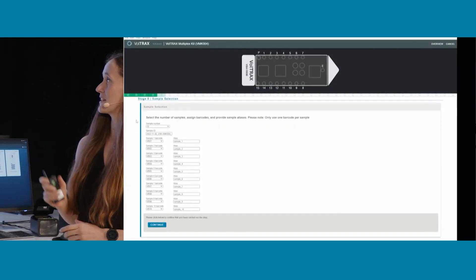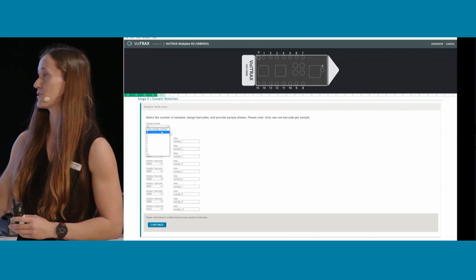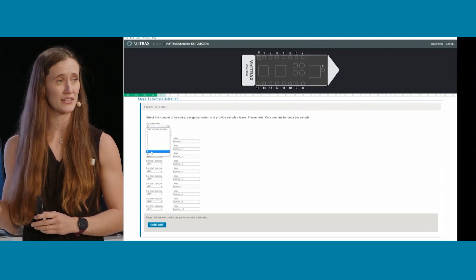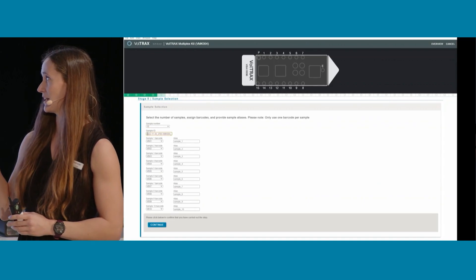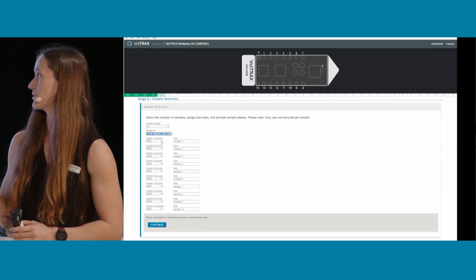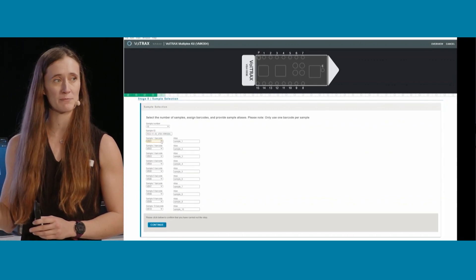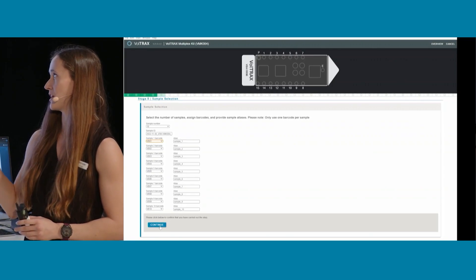This is our VMK sample input sheet. You can see the sample number, and it allows you to select anywhere between 2 and 10 samples. You can enter the sample ID, which auto-populates with the date, the kit name, and the cartridge and device ID. Then you can choose which barcode you're adding and which sample corresponds to it.